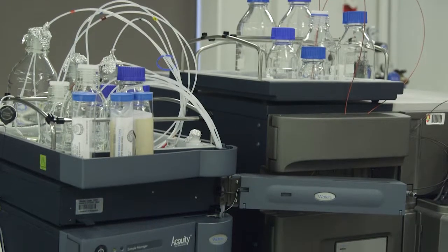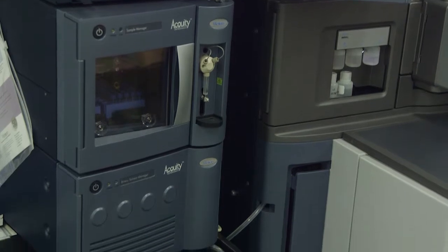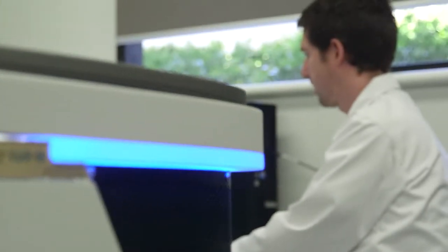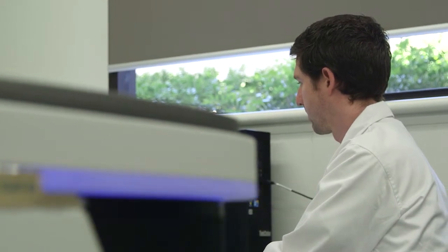In addition, we also have another piece of equipment, which is an imaging mass spectrometer, which is an even more recent development, where we can take tissue sections, whether they're from humans, animals or plants, and look at the distribution within a tissue section. So we can understand how a plant responds to some pathogen attack, how plants develop. We can look at the growth ends to see exactly what compounds are being accumulated as the plants grow.